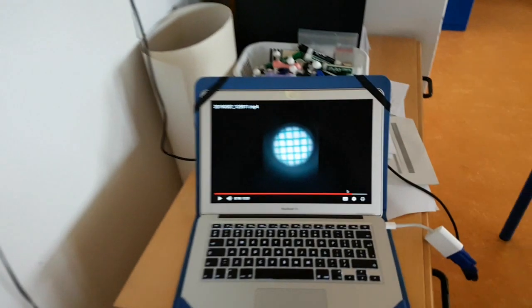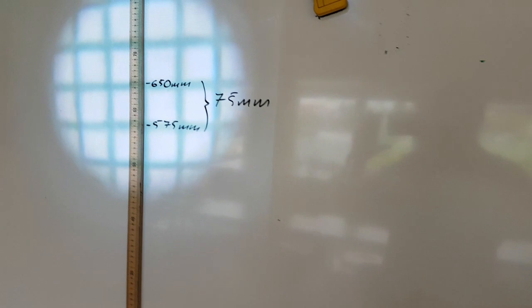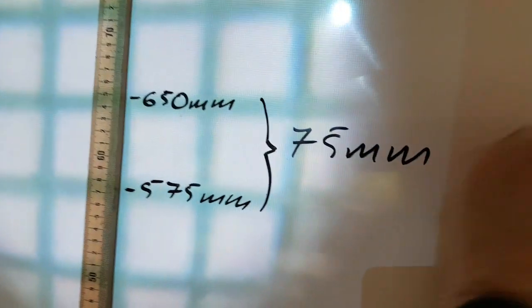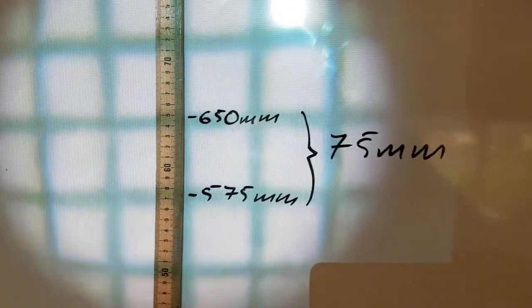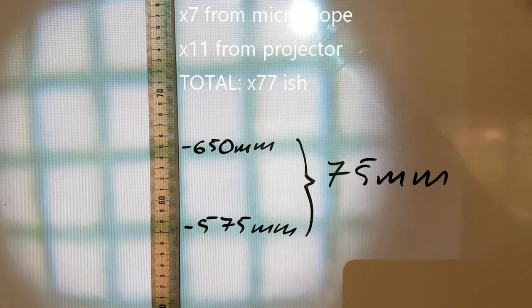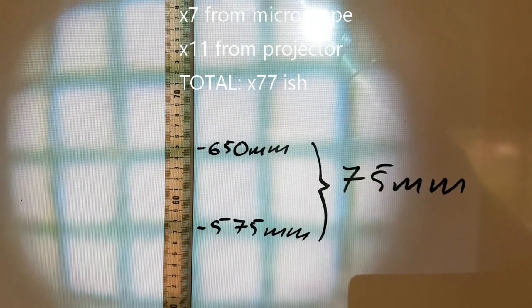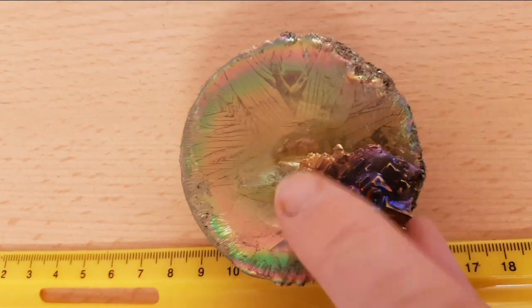In an attempt to get my times 60, I'm going to project up onto my smartboard — smart my ass, it's just a piece of plastic. I'm getting 75 millimeters here, so this is times 75 if you put the magnifying glass on the phone and then project it up. Here's the bismuth crystal that I bought from AliExpress.